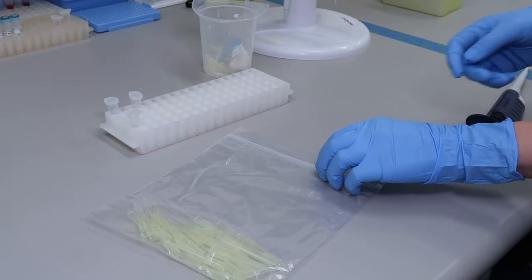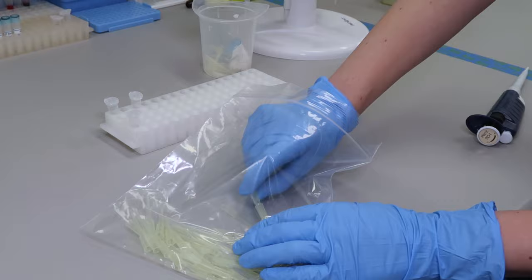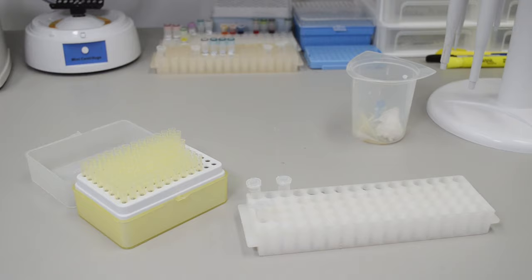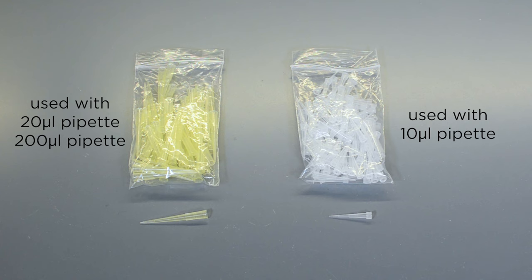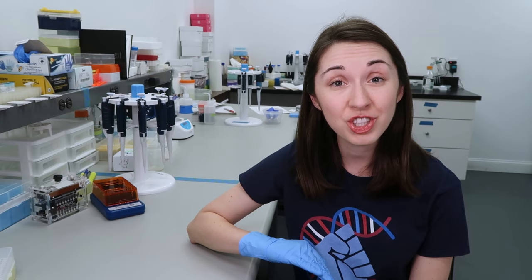If your pipet tips come in a loose bag, you will want to carefully pick a tip up by the sides and slide it firmly onto your pipet. If your tips are provided in a rack, firmly tap your pipet into one of the tips to secure it to the end. Always make sure that you are using the correct size tip for your pipet. With both methods, make sure the tip is firmly attached. And make sure to always use a tip. Liquid should never enter the main body of the pipet.